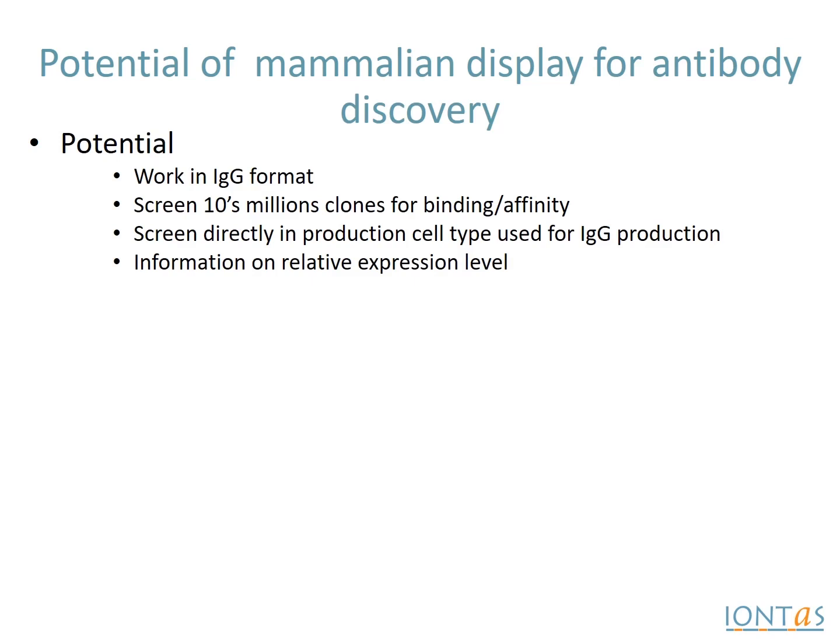We can perhaps anticipate what's going to happen in terms of expression of the soluble antibody as well, or certainly if an antibody is going to eventually be a very poor expressor, we might hope to anticipate that by looking at the expression level on the surface. But going beyond that, we believe that we can anticipate potential additional developability problems that emerge once one starts concentrating antibody up to a high level, and we'll come to that.